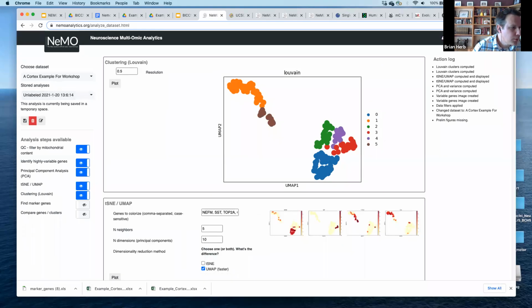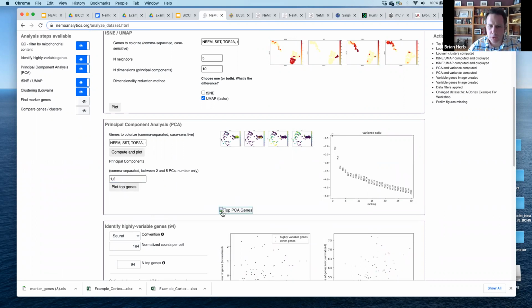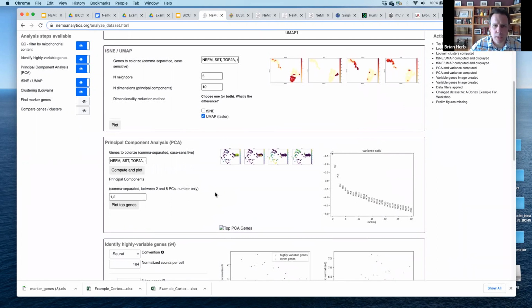All right, so there was a question about the PCA, if there's an error. Oh, for this, I think there might be an issue with plotting the top genes. Sorry, I don't know if I should be responding individually to the question. This image right here, there's somebody actively working on this display. There's something that popped up in the last few days, so that will be fixed.